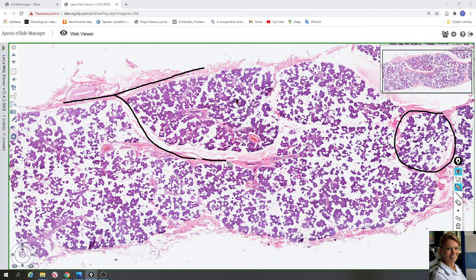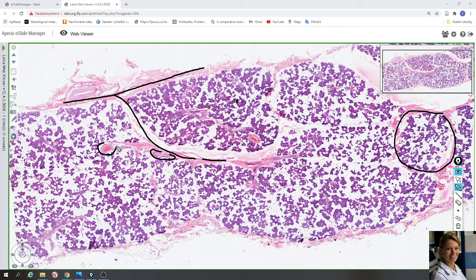Located in the connective tissue septa between the lobules are an arteriole, venule, and tubular excretory ducts — for example here. Also here is a large blood vessel in the connective tissue septa.